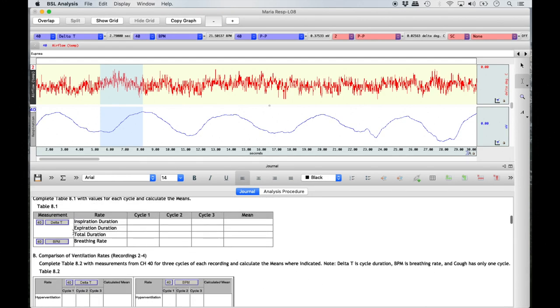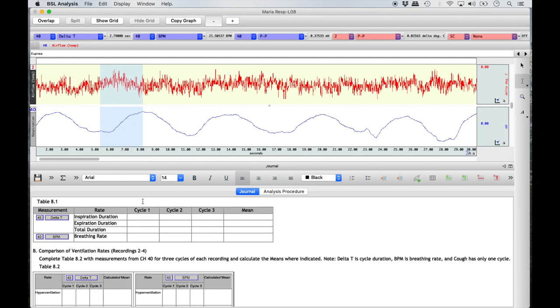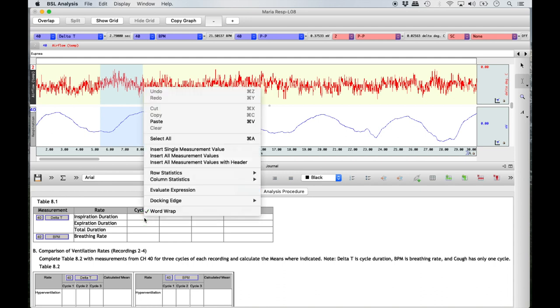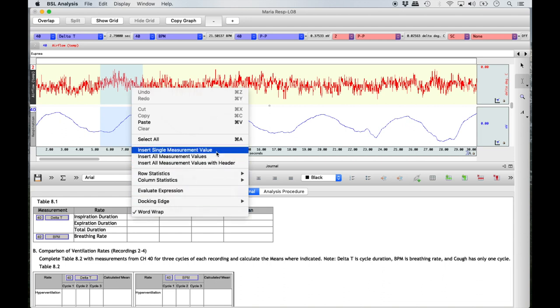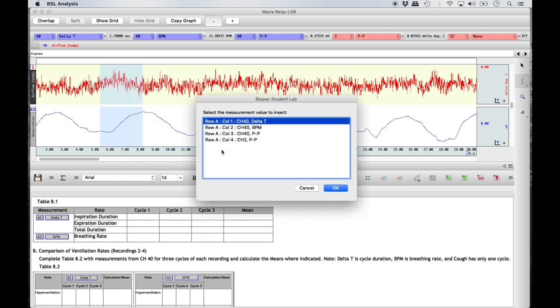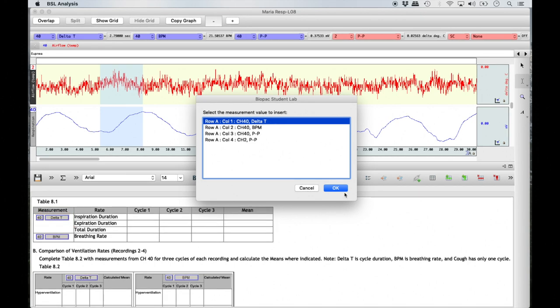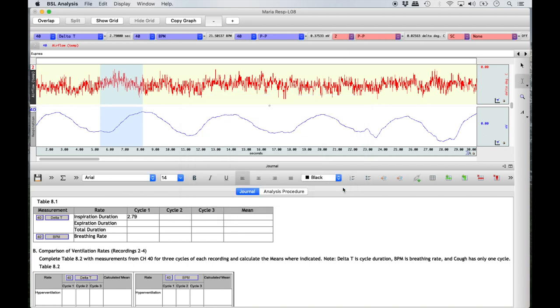To insert the duration of inspiration for cycle 1 in Table 8.1, bring your cursor over the appropriate column and row and right-click in the table. Be sure not to right-click outside of the table. From the menu that appears, select 'Insert Single Measurement Value.' In the BSL window that opens, select the appropriate measurement — for Table 8.1 you are selecting Channel 40 Delta T for the first two rows, which is the preselected first option. The duration of inspiration for the highlighted cycle will then appear.